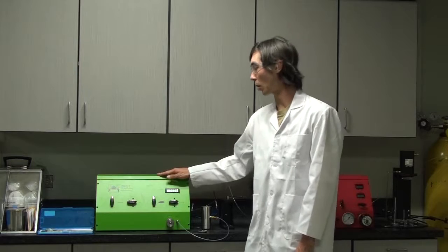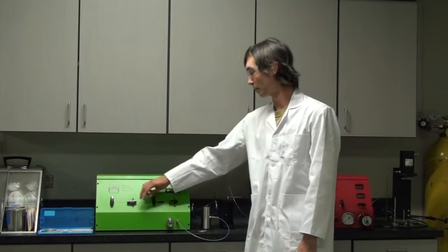The porosimeter we use here is TPI 219 instructional gas porosimeter, as shown here. So I'll begin with a description of the equipment. As we see on the front panel of the porosimeter, there are valves. First step is to close all the valves on the front and the back panel of porosimeter.